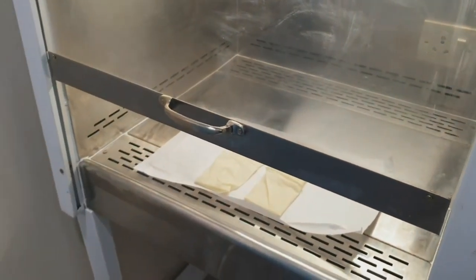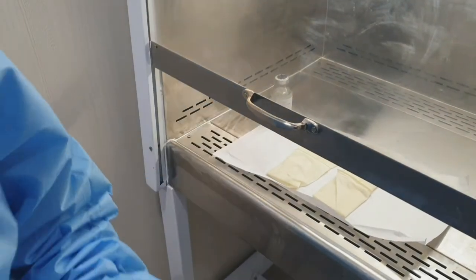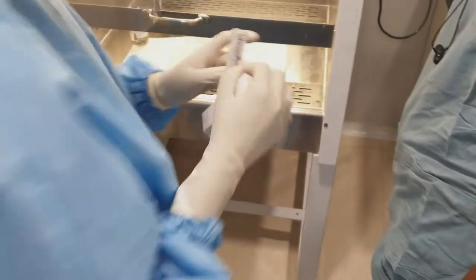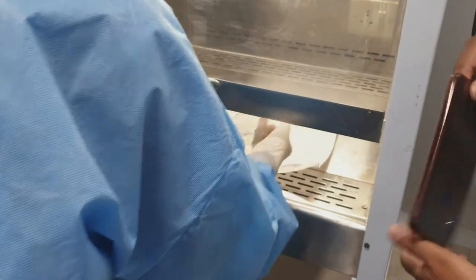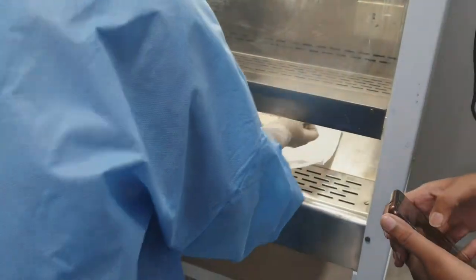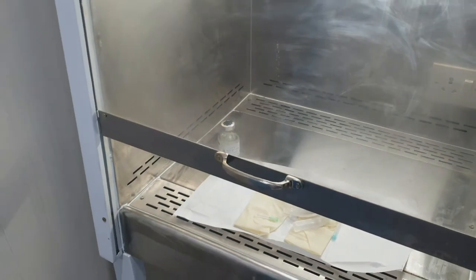She is placing all the required materials from the tray into the laminar hood area. Our drug today is Daunorubicin. She will be reviewing the drug chart shortly and rechecking the drug. All the required materials are peeled off and put inside the area. It's an alcohol swab.